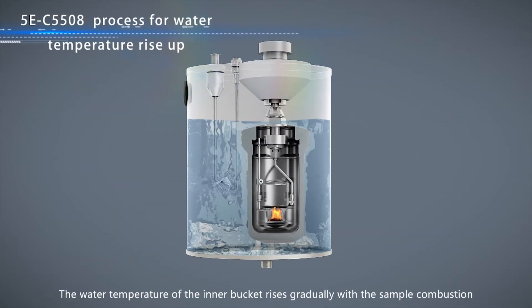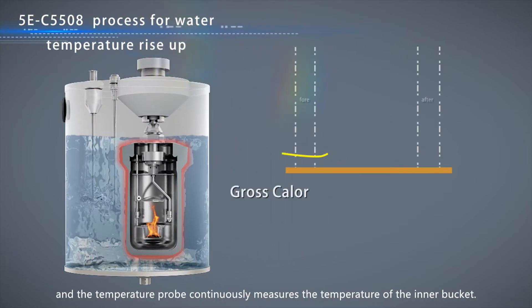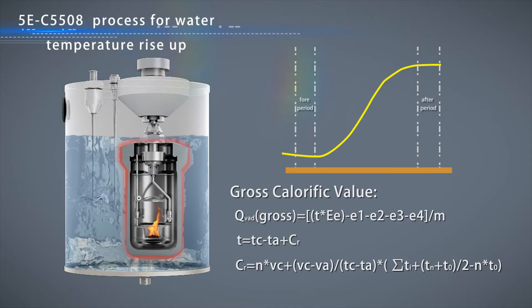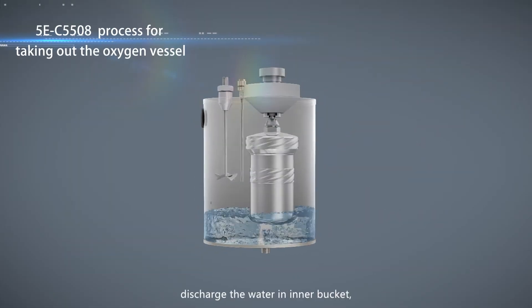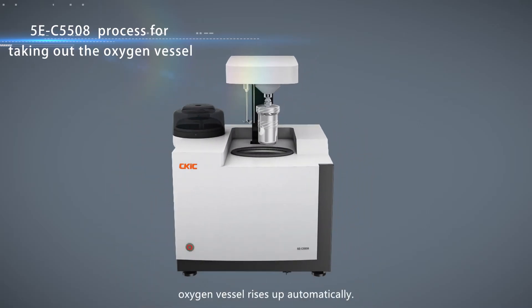The water temperature of the inner bucket rises gradually with the sample combustion, and the temperature probe continuously measures the temperature of the inner bucket. After the analysis, discharge the water in the bucket. The oxygen vessel rises up automatically.